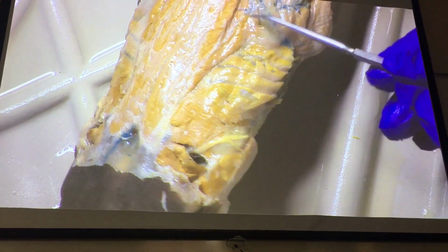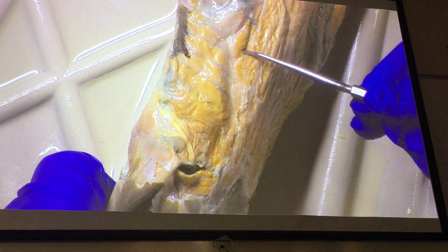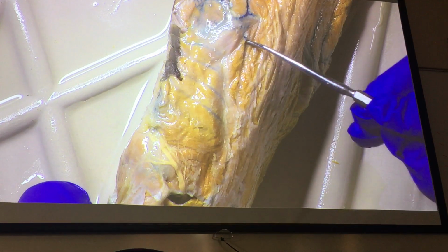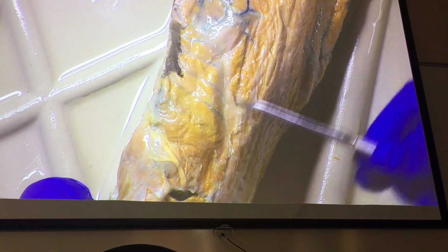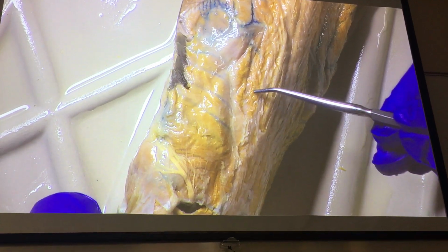And then we have this muscle here, which again, I guess I should have grabbed a different one because it's kind of a little wrinkly. Sorry about that. This is how you separate out the muscles. There's our cucullaris. All I'm doing is pushing at it with the tip of the probe. That's it. It's all you need to do to get those borders showing better.